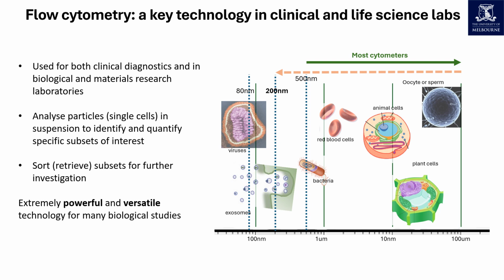In biology, cytometry is used to analyze mostly single cells ranging from half to 30 micrometers in size in heterogeneous mixes. Cytometry provides information about their phenotypes and frequencies by measuring physical properties and fluorescence.